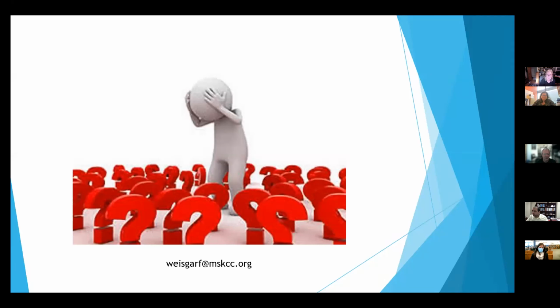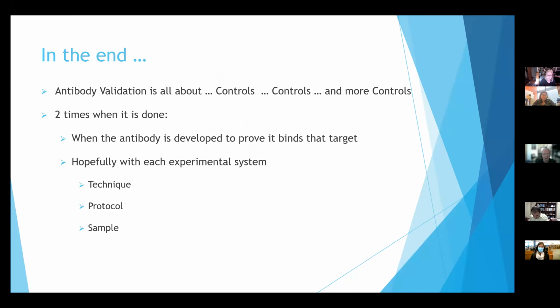Thank you. Francis, I go to Antibodies R Us and I buy some antibodies. Do they tell me the ways in which I should use that antibody? So how they validated the antibody? Because I think that was a source of that reproducibility issue. Yeah, so minimally they have data, and they should tell you how they do it, but a lot of times they're just distributors and they don't actually know how it was validated. They were just given a figure and some minimal information, but what they won't have is the protocol. They might have known that they were HeLa cells or Jurkat cells, and they definitely won't have the technique.